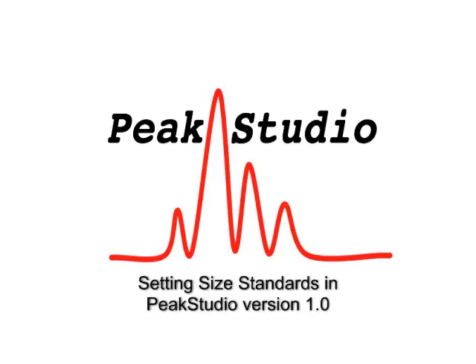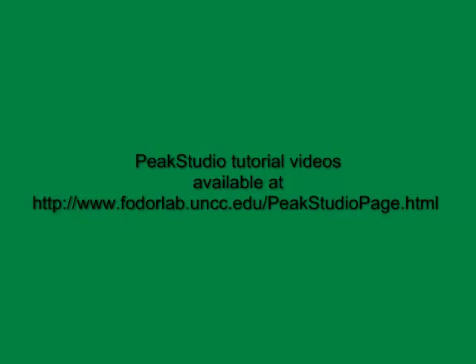I'm Tim Hamp, and in this video I will discuss how to set size standards for analysis of your spectra in PeakStudio. If you haven't watched the Getting Started tutorial video yet, you may wish to do so before viewing this one.